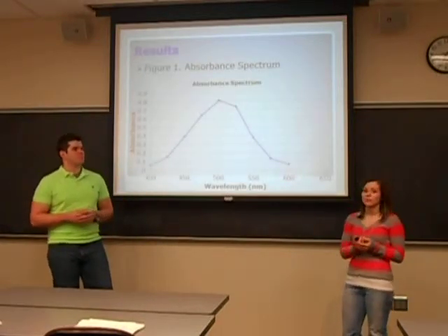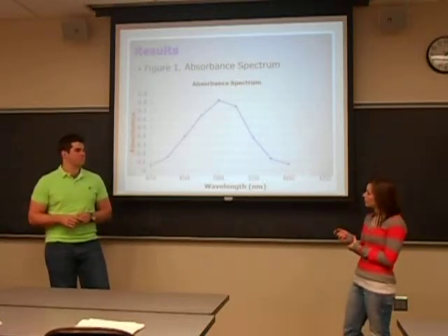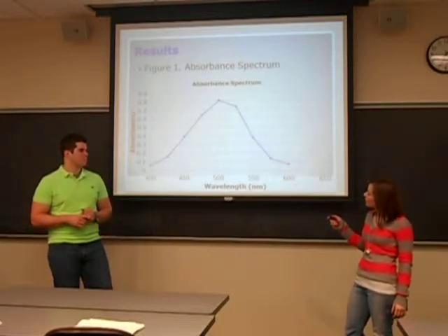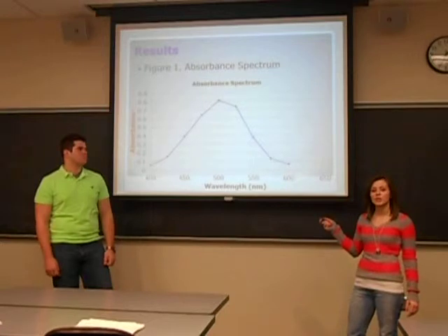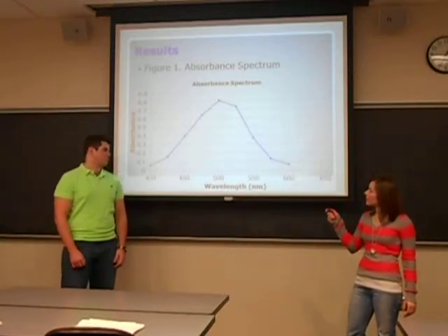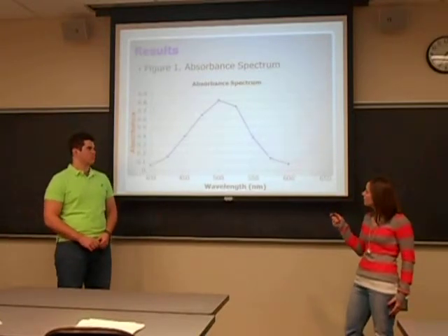So this is our absorbance spectrum that we found. As you can see, it displayed the relationship between absorbance and wavelength. As wavelength values increase, absorbance values increase until the lambda max of 500, and even though wavelength values continue to increase, absorbance values decrease.